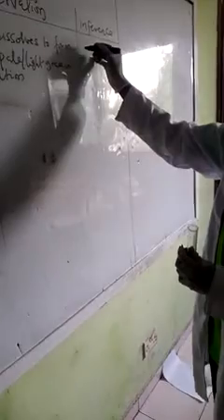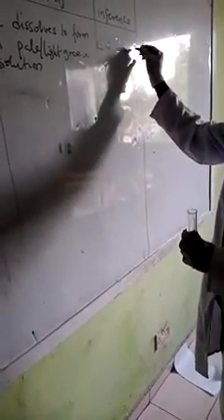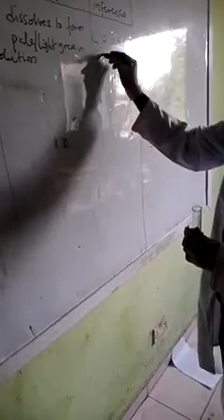All right. So what will be the inference? If C dissolves to give a pale green solution, you say C is a soluble salt. I thought they said we should use litmus. It's step by step. We are going to use the full litmus and see the one that will have the effect on it. So we'll start with it, because we don't know the salt.